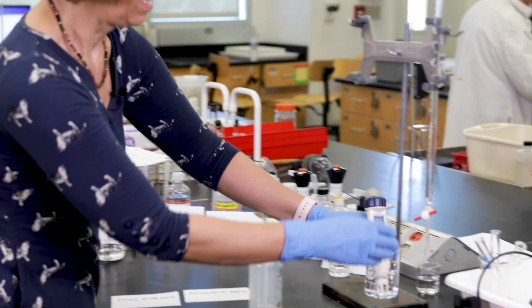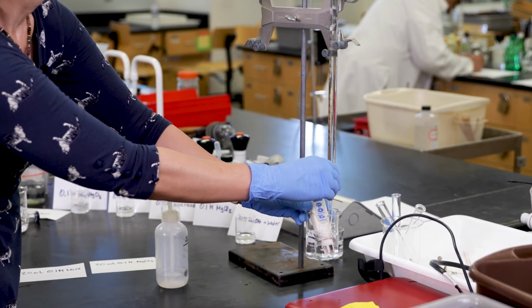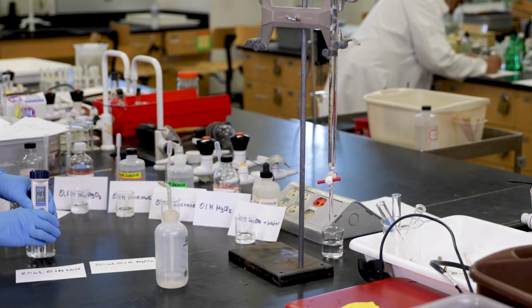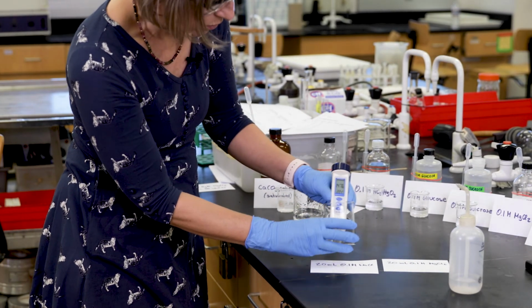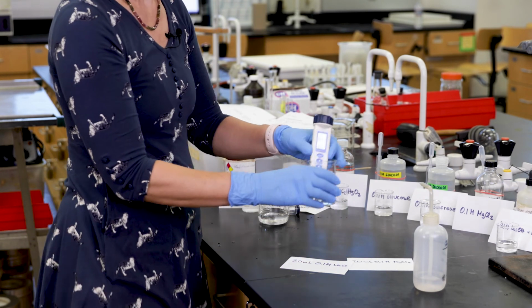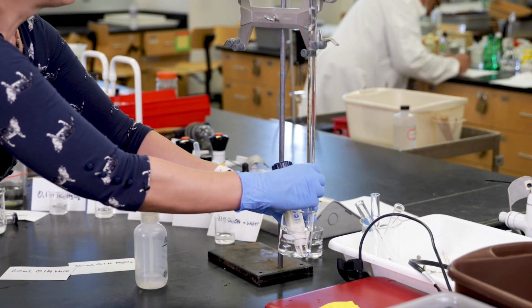Let's add another 10 milliliters. Stirring it. Becomes more and more volume. 1,473 microsiemens.